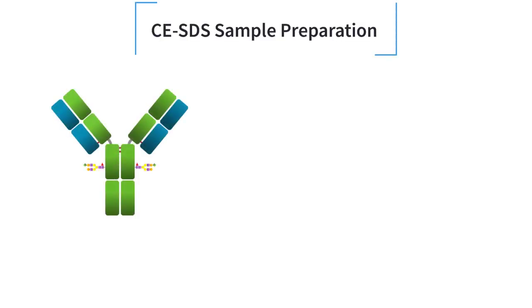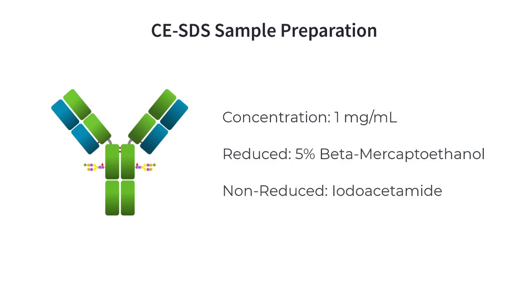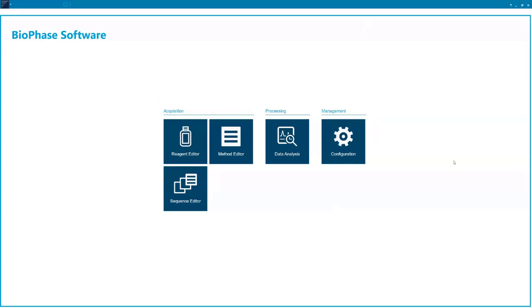Now for our sample prep, the sample prep that we're going to look at today is we're preparing our sample, in this case a mAb, down to about 1 mg/ml for both reduced and non-reduced. For our reduced, we're adding a slight amount of beta-mercaptoethanol, about 5%. And for our non-reduced separation, we're adding a small amount of iodoacetamide to ensure that we do not have any disulfide scrambling taking place.